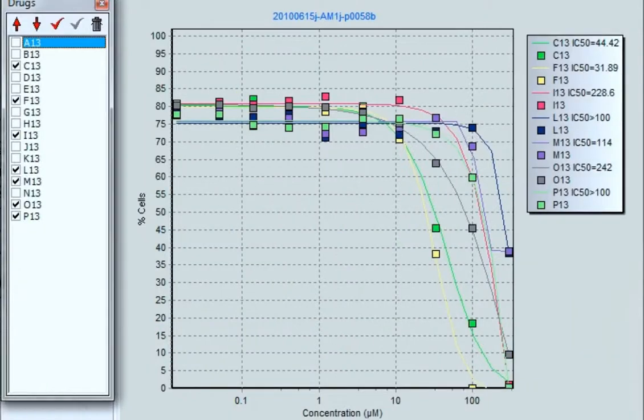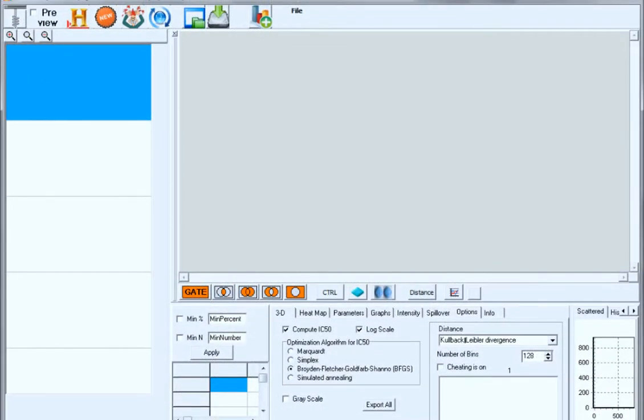Here's a look at how it operates, and then we can look at its interactivity. First, you see there's a blank screen with all its components. There are three main areas of the screen: left, top, and bottom. A series of drop-downs lets you change your views, but the model we've chosen is that the important things are the analytical components, so these will be emphasized.